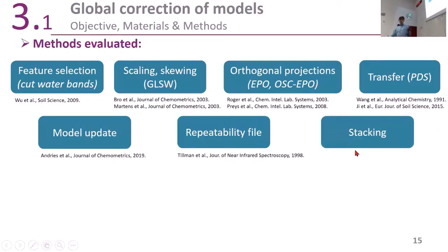And then we tested stacking, where the principle was to actually stack all those methods together. Those are the predictions that were made by each of those methods. We did a PLS on those predictions to predict the BMP, in the hope of really robustifying even more, because we know that each method could have its own bias and performances.